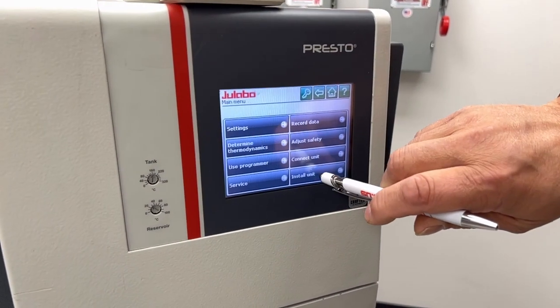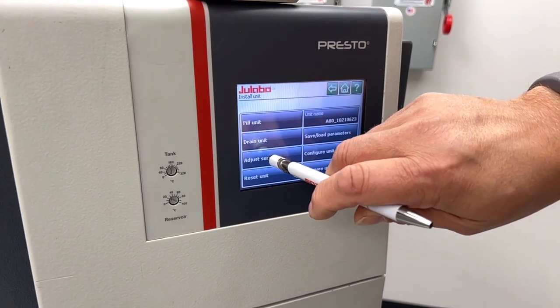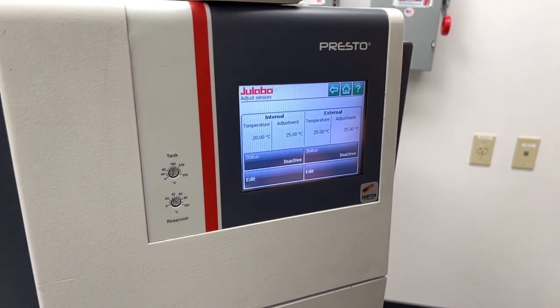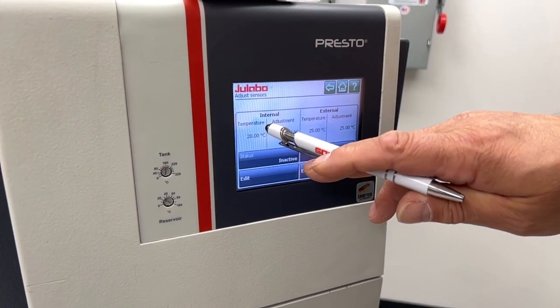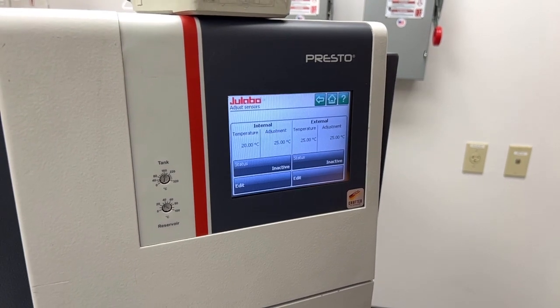You first go into the menu, then Install Unit, and there's a feature called Adjust Sensors. You have an internal calibration and an external calibration that can be performed.